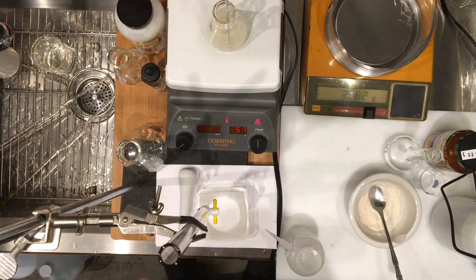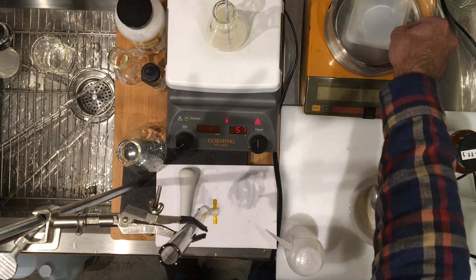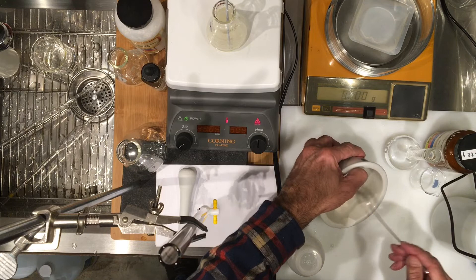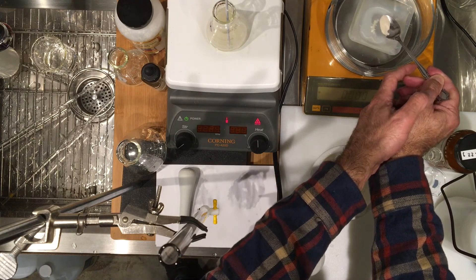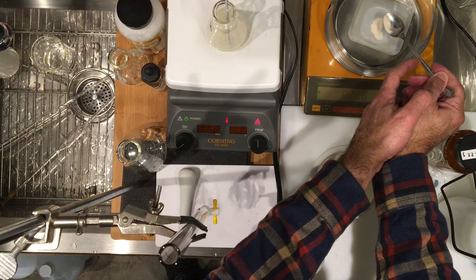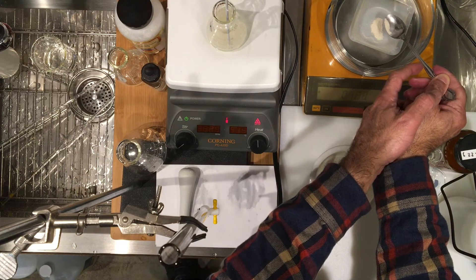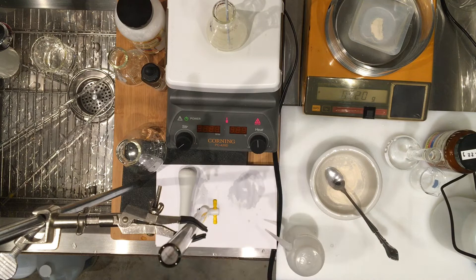Now let's weigh the second sample — again about 0.5 grams. I'm going to zero the mass; this is for the second flask. I won't try to get it to exactly 0.5. Here it is — for your second flask, record 0.520 grams.